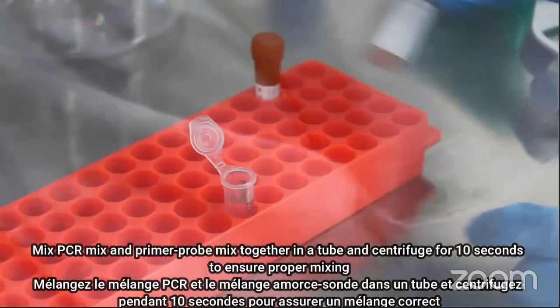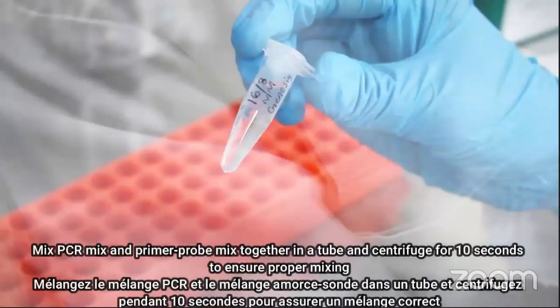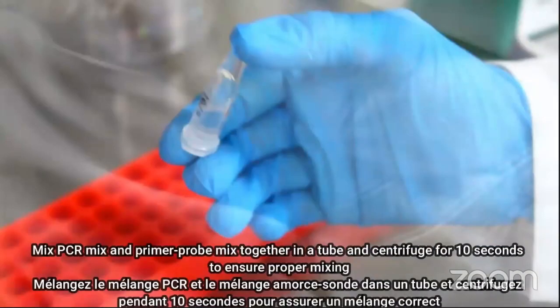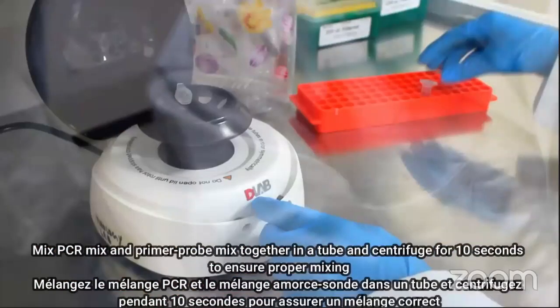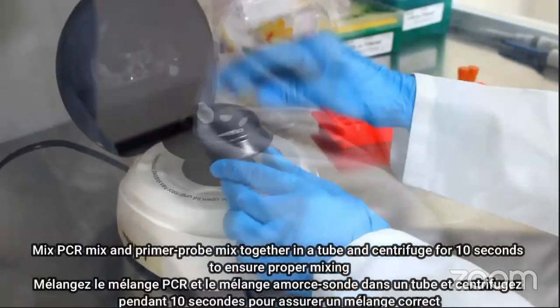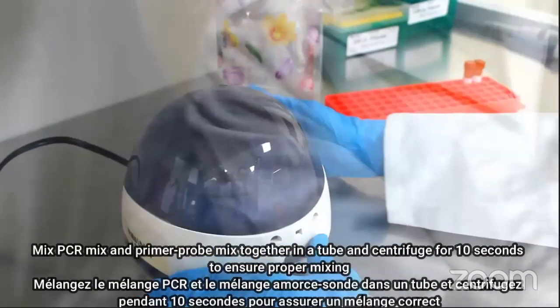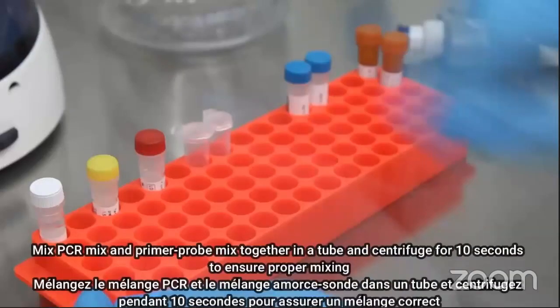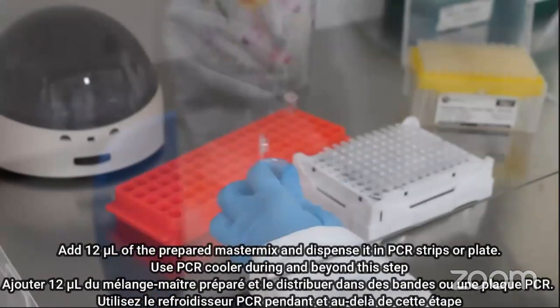While you are preparing any reagent or while you are using any reagent, immediately cap your tubes to prevent any kind of contamination or spill. It's true with all kinds of tubes and reagents. Now, spin it for a few seconds, like 10 to 15 seconds, to ensure proper mixing and settling of the master mix. Now take 12 microliter of the prepared master mix and dispense it in PCR strips or plate, whatever you are using.